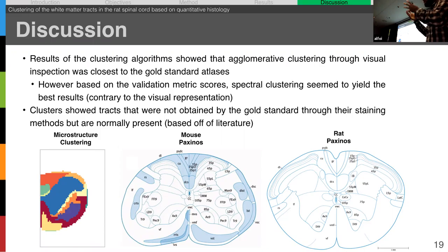So we can look at all the range. You can start delineating, looking around and asking, where does that diameter range stop? And you also have to know what the range is, because even within a specific area, all the axons aren't going to be the same diameter. There are going to be variations, right? It's not like you're going to have a clump of axons that are all 5 microns or whatever; they'll vary. So you would have to establish this is the range, and after this range the next tract is this, and these are the axon diameters within that range, and so on and so forth.